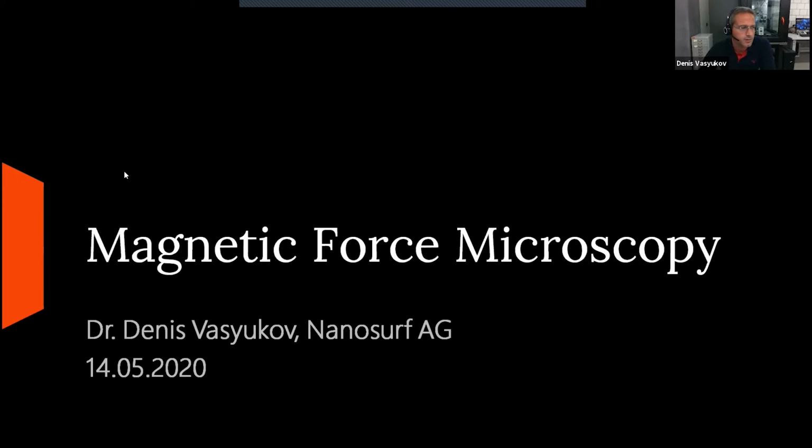As you already heard, my name is Denis and I will be talking today about magnetic force microscopy and how to do it with Nanosurf AFM systems.